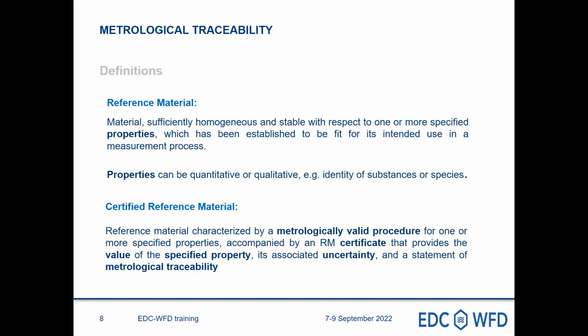Still some definitions, but some of these are really important. What is a reference material? It is a material sufficiently homogeneous and stable with respect to one or more specified properties, which has been established to be fit for its intended use in a measurement process. Properties can be quantitative or qualitative, and for instance, when it is qualitative, it is the identity of a substance or species.